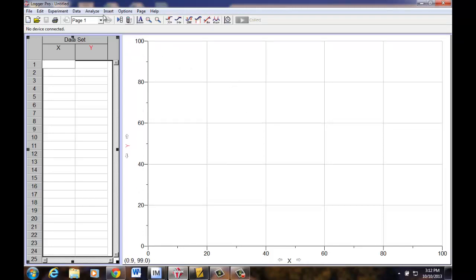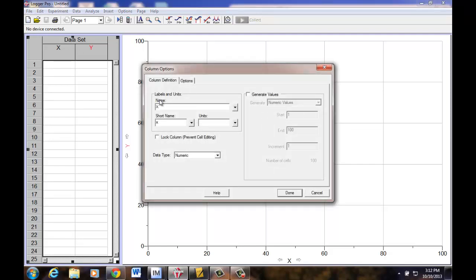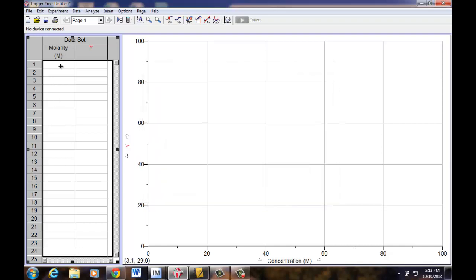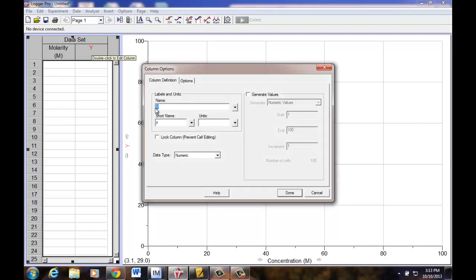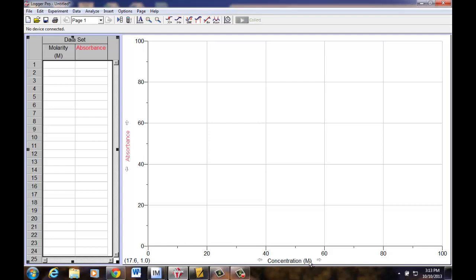Notice that I have an xy axis and I have a set of data. What we want to do first is put our cursor over the x and I want to label the x. We're going to call the x the concentration axis. So literally type in concentration. Its short name can simply be molarity, and the unit there will be a big M molar units. Now notice that appears in the x. We want the y to be the absorbance, and the absorbance has no unit, so for us right now we'll just leave that blank. Notice we have concentration in molarity units on the x and absorbance now on the y.